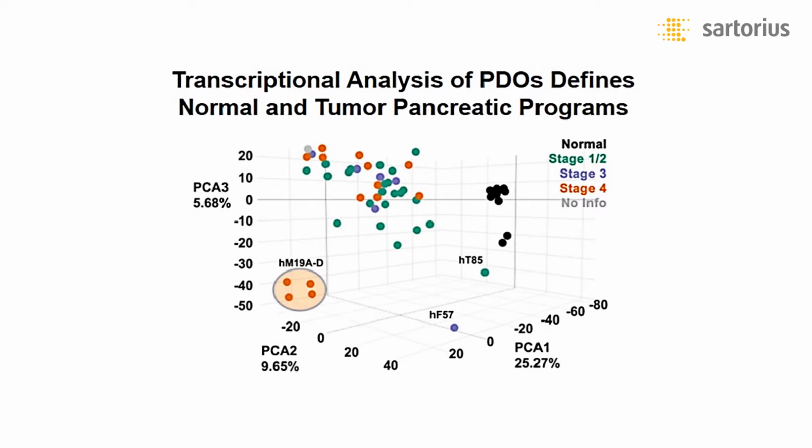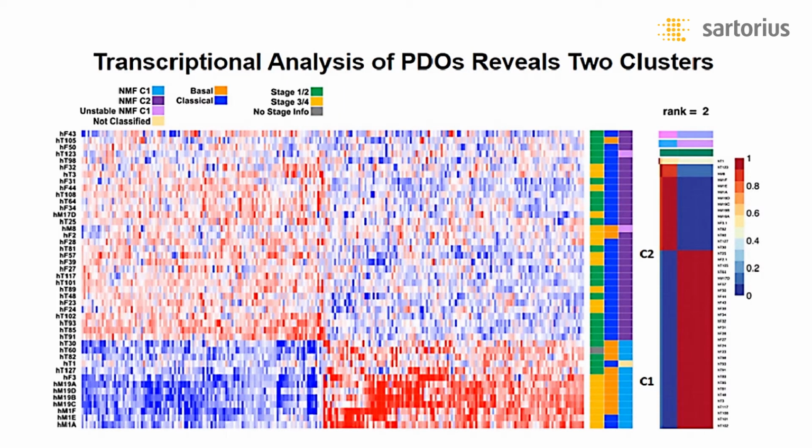So you can look at the RNA that way, or you can look at the RNA this way on the next slide, which is slide number 16, showing you 2 different patterns, roughly speaking, of gene expression in the organoids, which at Cold Spring Harbor we called C1 and C2, and they're very similar to 2 different types of pancreatic cancer that were discovered by Andrew Biankin and Peter Bailey, as well as Eric Collisson and Richard Moffitt and Jen Jennifer Jaquish. And so we can see the 2 types in the organoids.